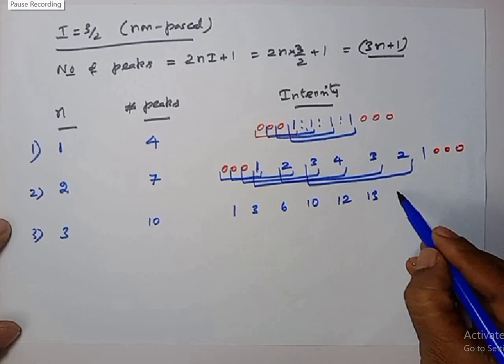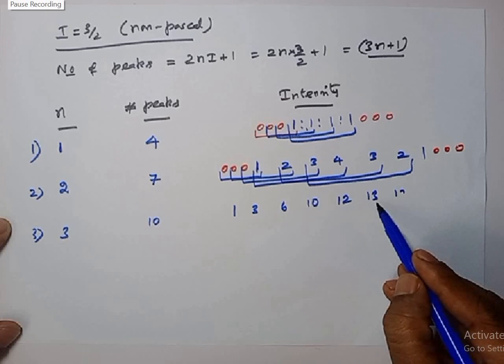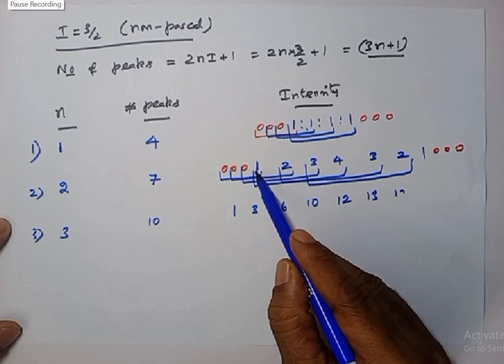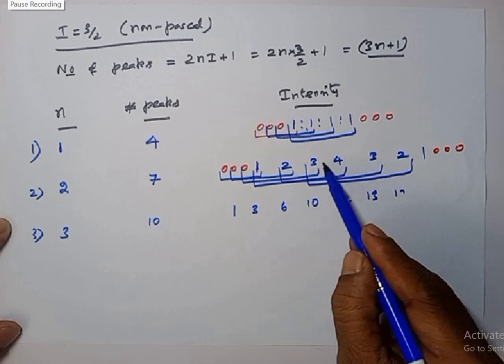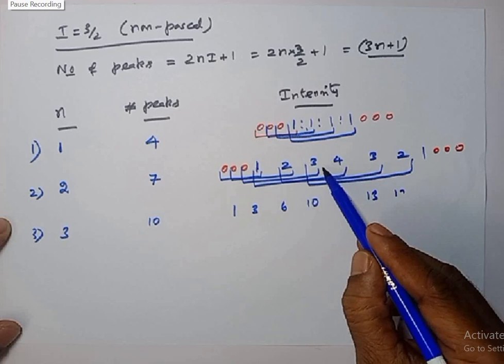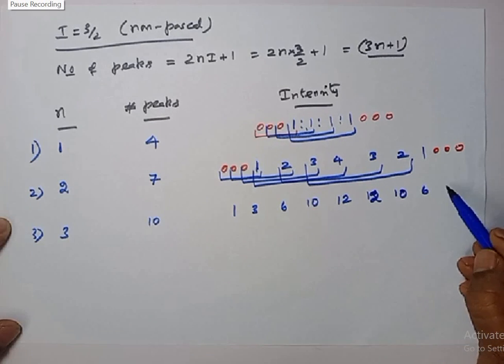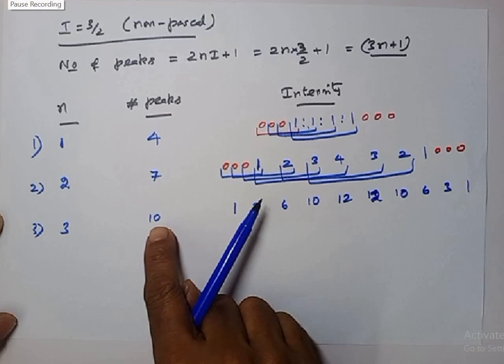Okay, then the reverse order. Sorry, 1, 3, then we get 6, then we get 4 plus 3 is 7, 10, then next numbers 3, 3, 6, 6 plus 4, 10 plus 2, 12, the next 4 numbers, 3 plus 3, 6, this is 12, I'm sorry, 12, then we get 10, 6, 3, 1. Okay, so this is the intensity ratio for those 10 peaks.